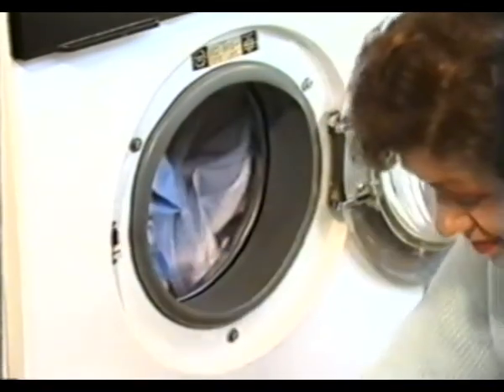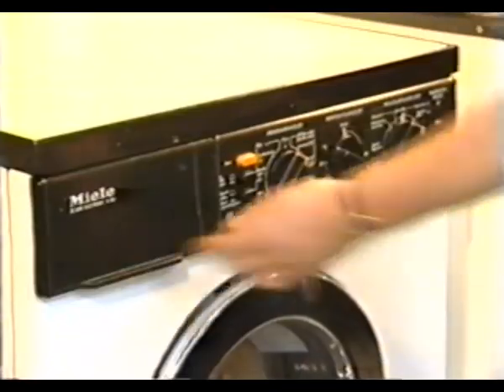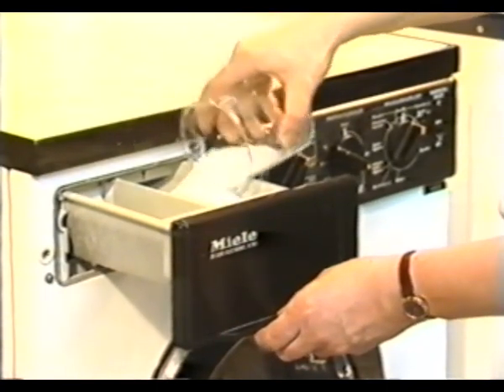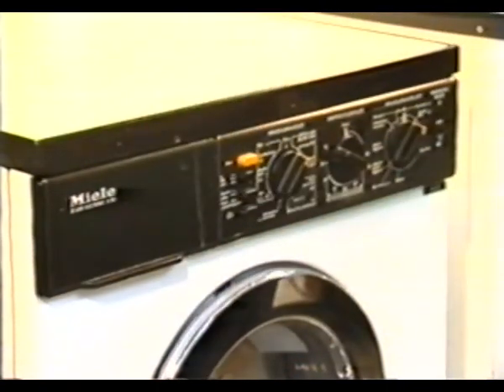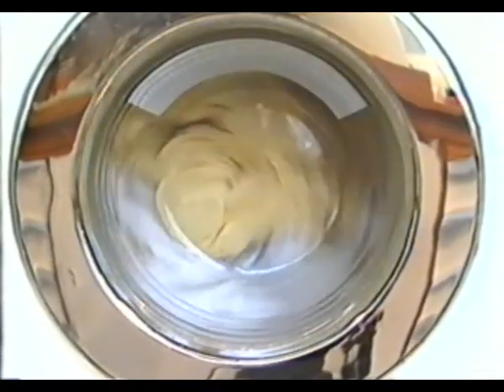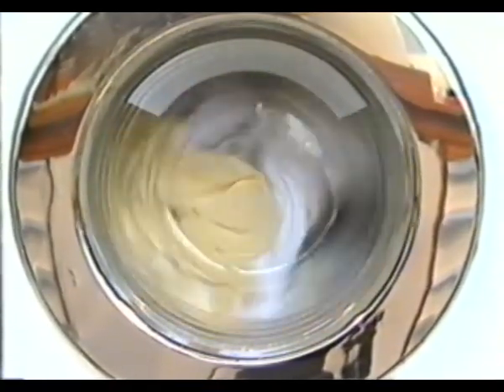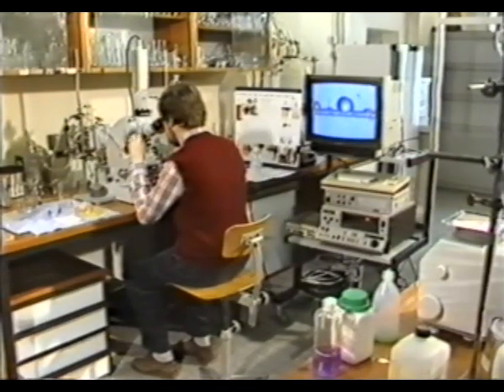Removal of stains from clothes is a general problem in fabric washing. Detergents have to be formulated in such a way that several complex physico-chemical mechanisms assist in the removal of these stains. In order to recognize and understand these mechanisms, the removal of soil from fabrics has been studied by video microscopy.